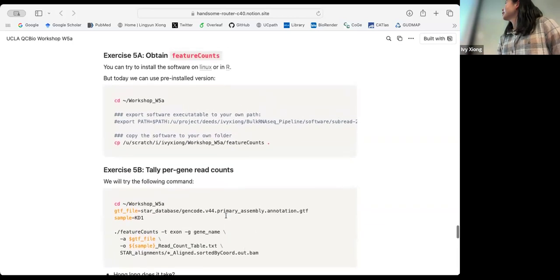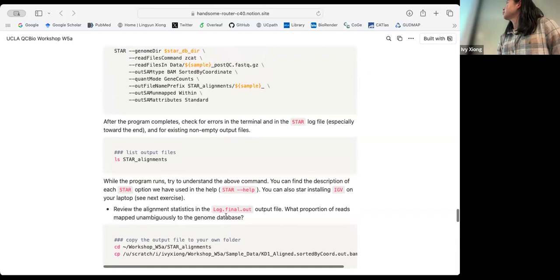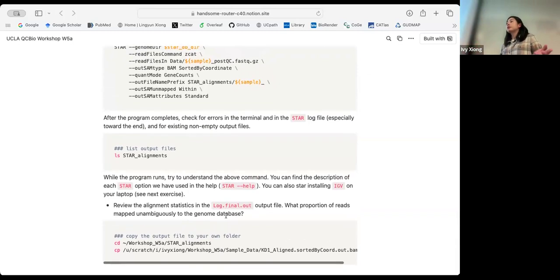So Melanie, that will be maybe for homework today. For the others, we can wait for the alignment to finish, and feel free to take a break because there's nothing we can do about it. You can open a new console to try alignment with SC1. Mine's saying that it finished, but it's not actually aligning, so that's why it's going so quick. It's not working. Do you want to find out why? Yeah.